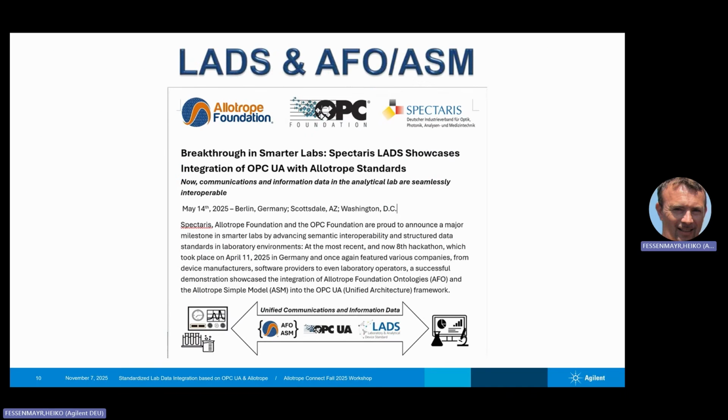Therefore, Allotrope Foundation and OPC Foundation together with Spectaris announced their collaboration in this area to integrate OPC UA and Allotrope.